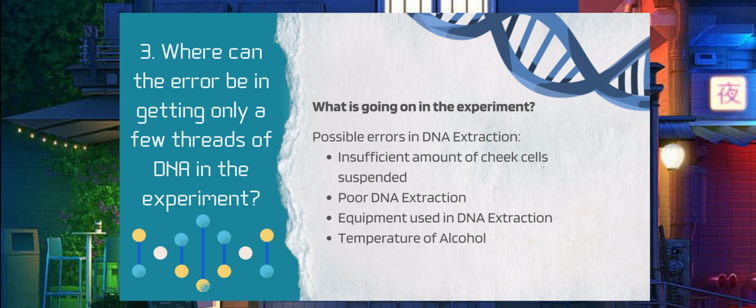According to Robbie, he tried the experiment again and vigorously gargled the salt water for exactly 1 minute and 30 seconds to ensure that some of his cheek cells would be extracted. And also, as I've said earlier, our gargling should really be strong. So more cheek cells will gather, or will be extracted, in the salt water. Okay, that's our first potential error.